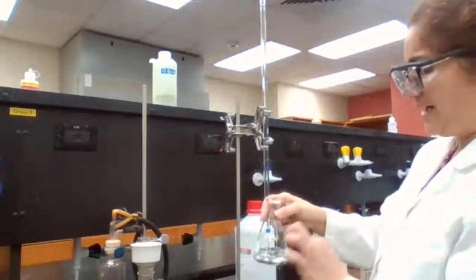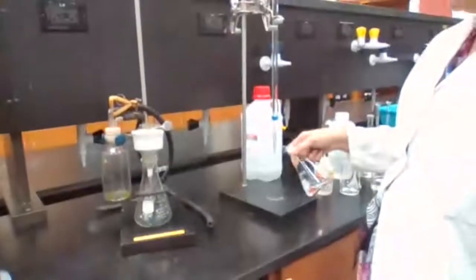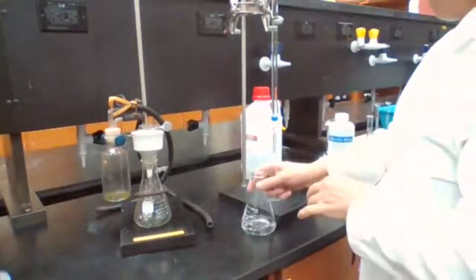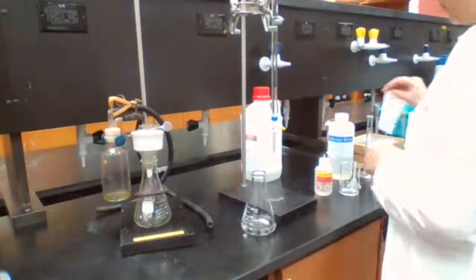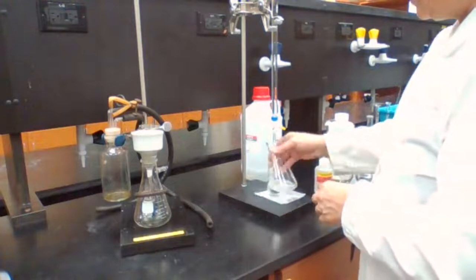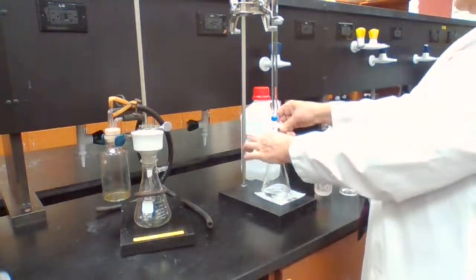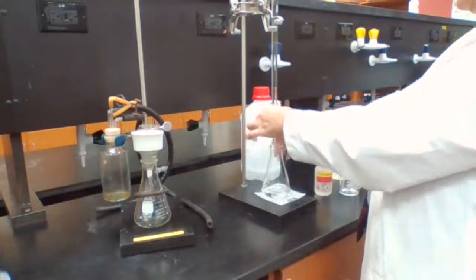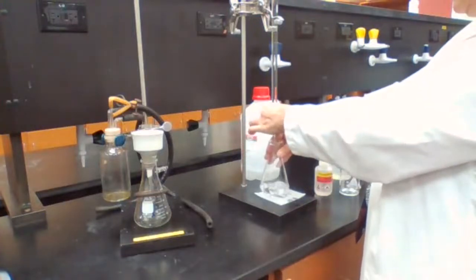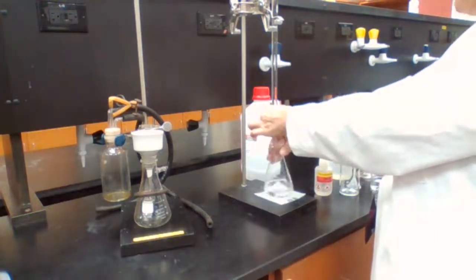In ethanol, I have the phenolphthalein, and I'm going to start the titration. The white background helps. I keep adding and swirling.